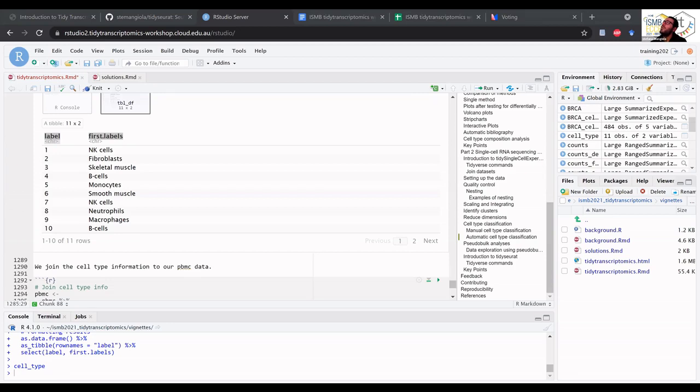I would think so. In this case, everything depends on the reference signatures. There are many reference signatures that are tissue specific. So in a way, you would hope that the result for all clusters will be the same, which might not necessarily be the case, because here you are analyzing single cell types, hopefully, while a tissue is composed of many cell types. So it's a bit strange thing to do in this case, but for sure there are ways to do it.